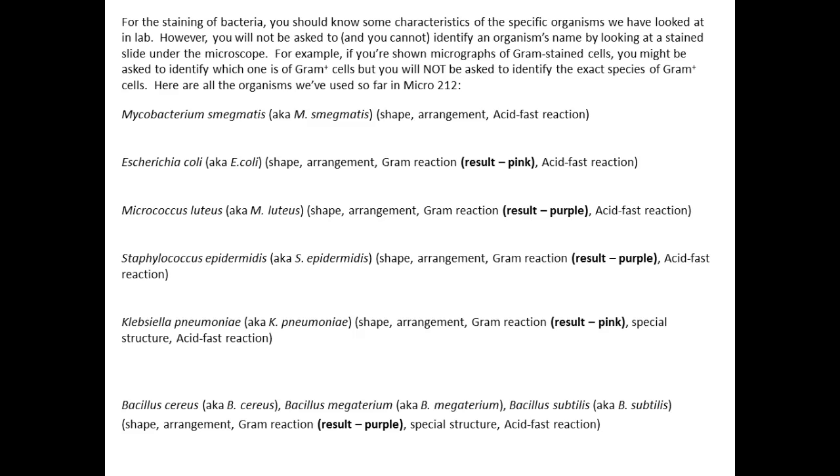The reason why we're using them today, anyone know what special structure they'll have? They will have endospores. Lots of bacillus have endospores. Of course, we're not going to work with the most famous one, Bacillus anthracis, because it causes anthrax. So these are non-pathogenic bacilli that form endospores, especially when you starve them, as I have done.